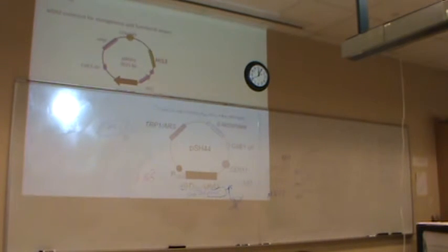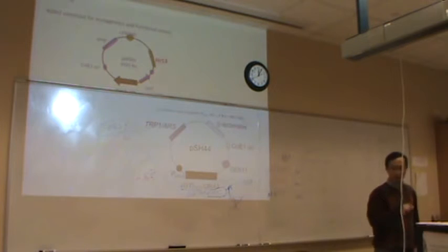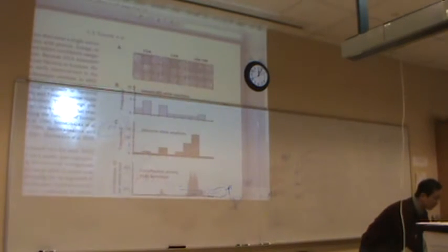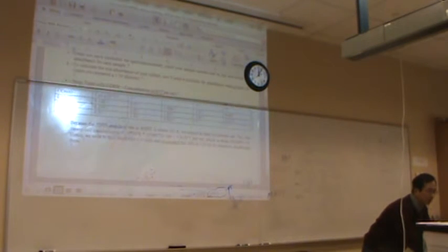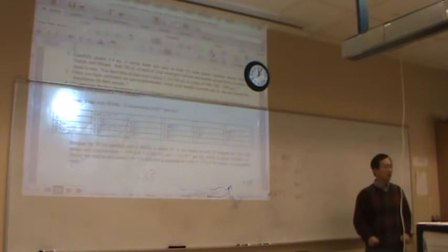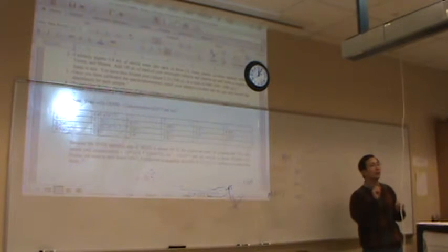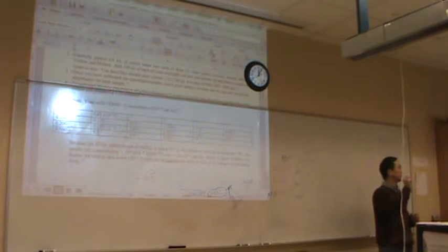Okay, let's start. So the protocol is, first we need to concentrate the cells. Our protocol actually tells you how to calculate officially how much cell we need, but we are doing this in an approximate way. We assume cells with the same OD have the same number of cells. So basically measure the OD, then concentrate the same amount of OD using optical density.